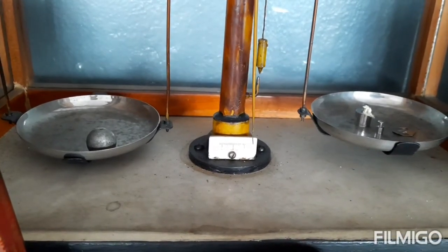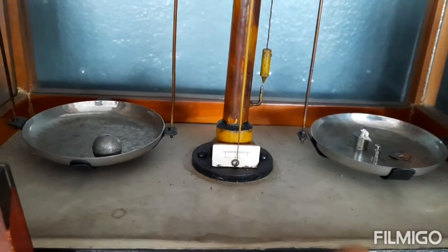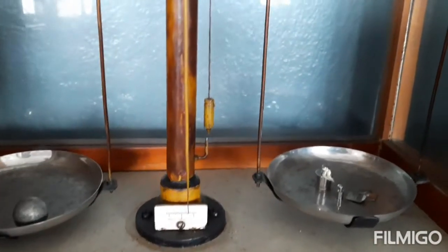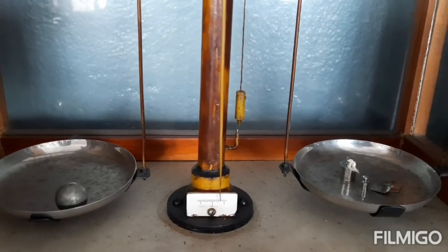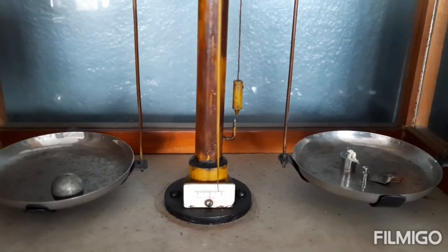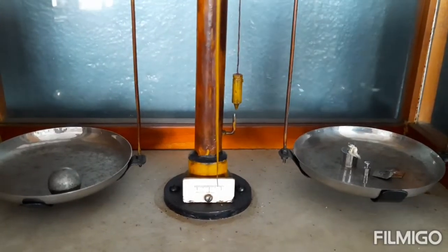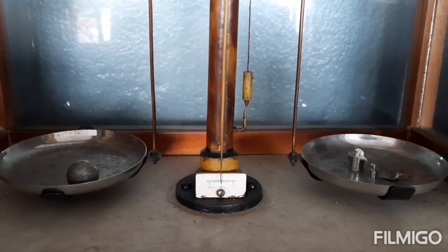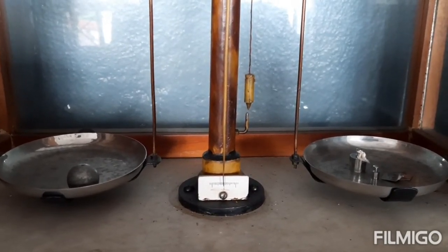It shows that the bob is more, meaning it is 500 milligrams plus some more. Now we try with 500 milligram plus 200 milligram — we find the pointer still moves towards the right only, not towards the left. That means the bob is a little heavier than the weight. Now we try with an additional 20 milligrams.